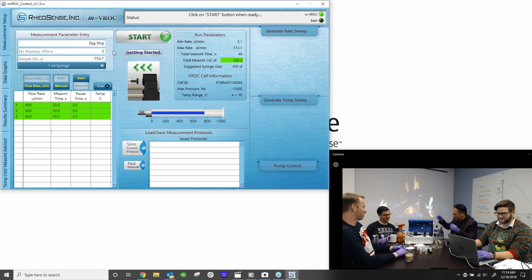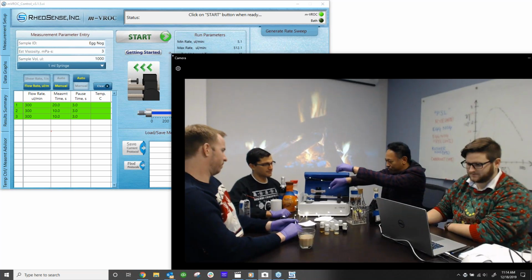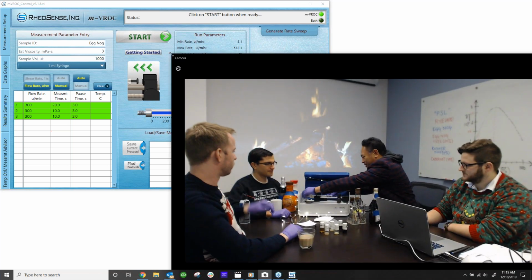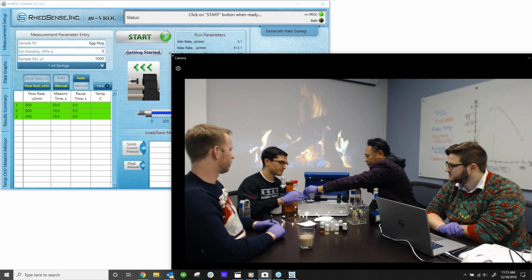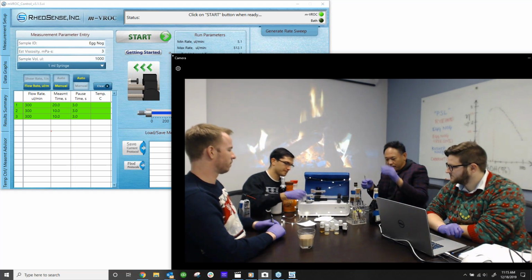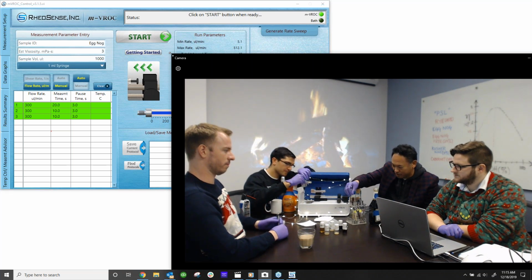All right. So as before, I'm just going to move some stuff around here. Open up the syringe jacket. Close the valve. Now we can move the push block. And so at this point, we can safely remove the whiskey. And what I will do next is test eggnog.